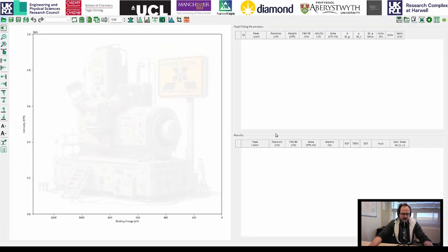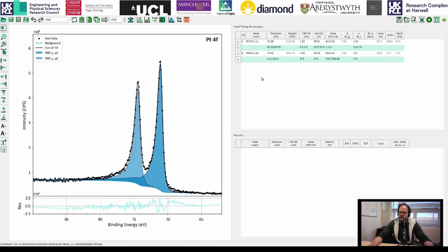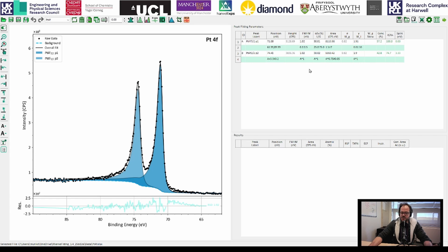We can go ahead and have a quick look at some of the sample data that Gwilym has prepared. I'm just going to open the PT4F so you can have a look at what the data looks like. Really nice and clean interface — if you're familiar with Avantage already, you'll probably be quite familiar with some of the layout and settings here. Curve Fit is capable of opening Avantage files, VMS files, FI files, Kratos files, and all kinds of files — really versatile in the kind of data it can handle. You can get everything into the same format and then export to Excel. It looks great and it's really easy to use.